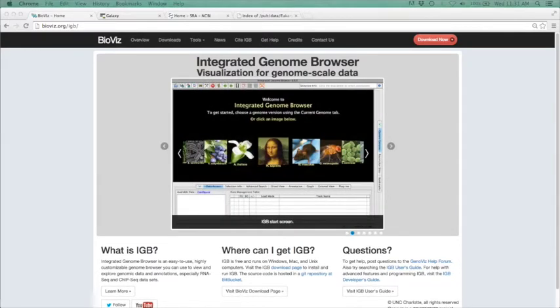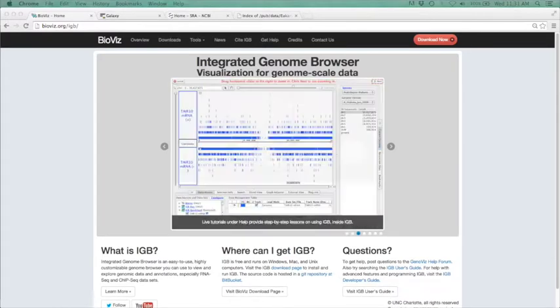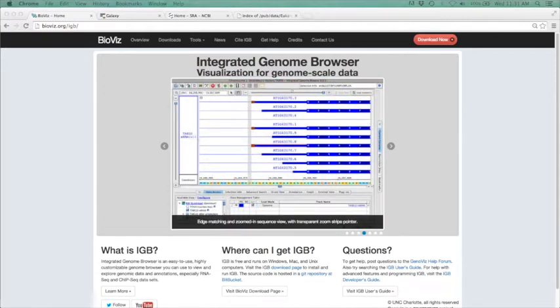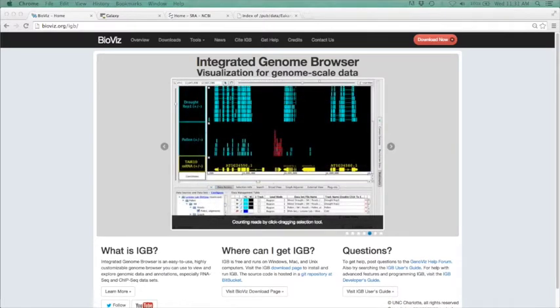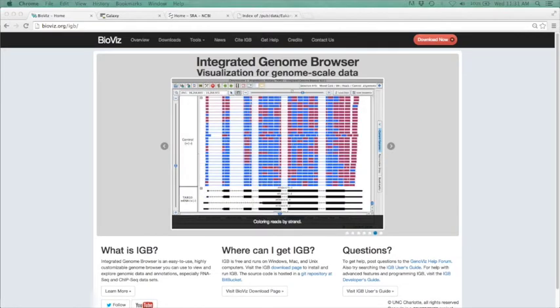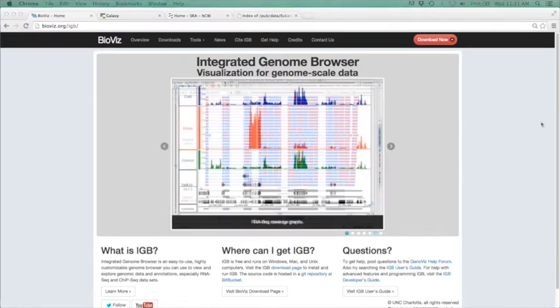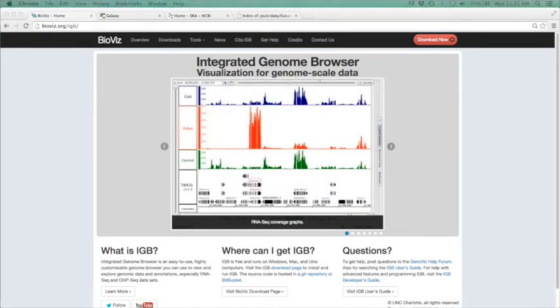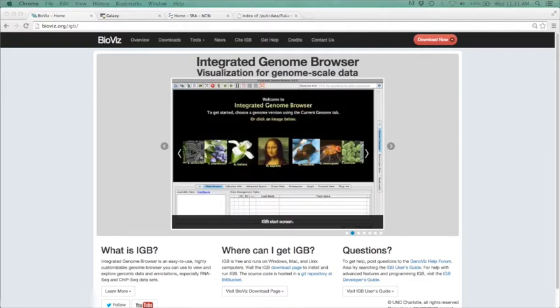The main key with the approach we are taking today is that it requires no programming. Everything will be done through a website called Galaxy. Galaxy is an open, web-based platform for biomedical research. Many of Galaxy's functions require no programming experience and can all be done through its web browser. All analyses are saved as a history, and any workflow you do can be repeated if necessary. For more information about Galaxy, please visit their wiki. We will be going to usegalaxy.org.